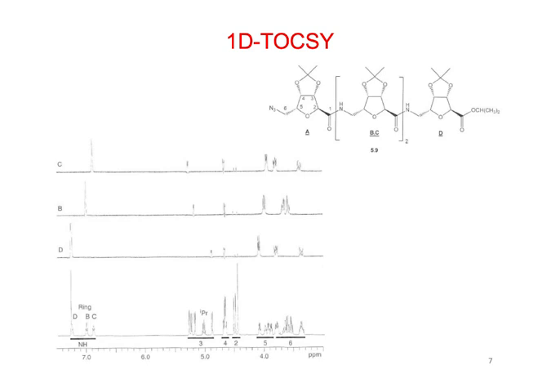In this case, I think they irradiate on some proton, and then they can likewise look at changes as the mixing times change. Or maybe this isn't a difference in mixing times. This is just looking at each of these coming off of D. So this isn't the ring, so let's think. So this must be this proton. No, it's 7.